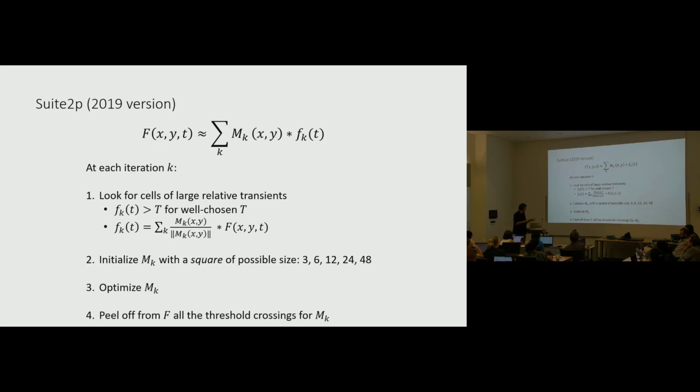We call this whole new thing, it's still, I think, in a branch. No, it's in the main version, but you have to call sparse mode 1. So it's not default on, but it's in the GUI as an option to turn it on. It's called sparse mode. So we found that it worked really well, at least on a lot of our data sets. I think it needs a little bit more testing, and that's what you guys are here for, a little more testing before we make it the default version. But the new algorithm shouldn't need you to specify much at all, really. You don't tell it how many cells or what spatial scale. It finds it itself.